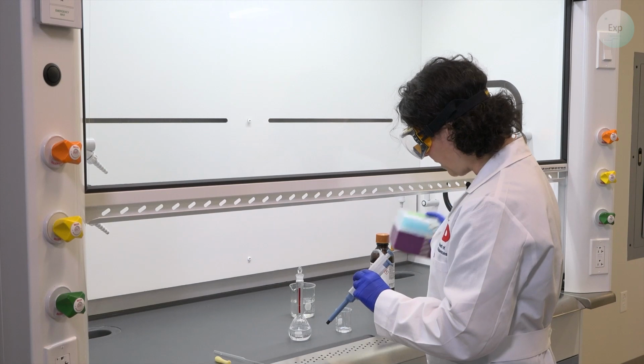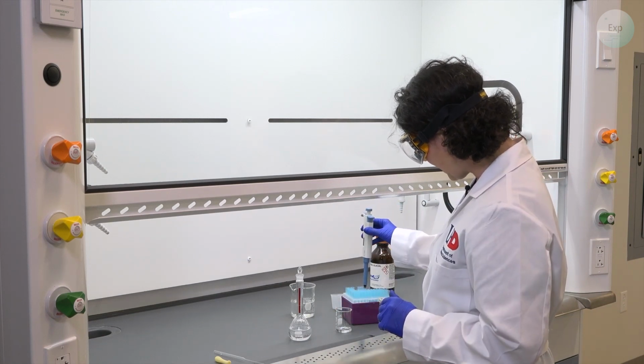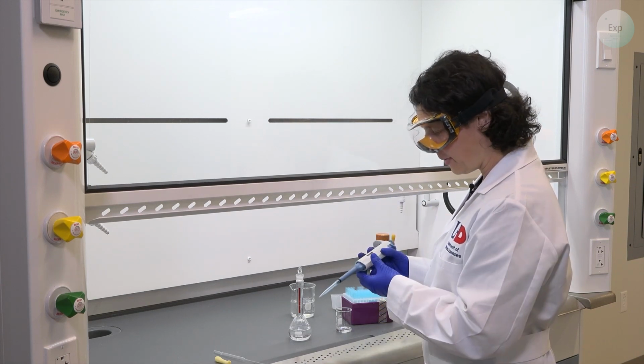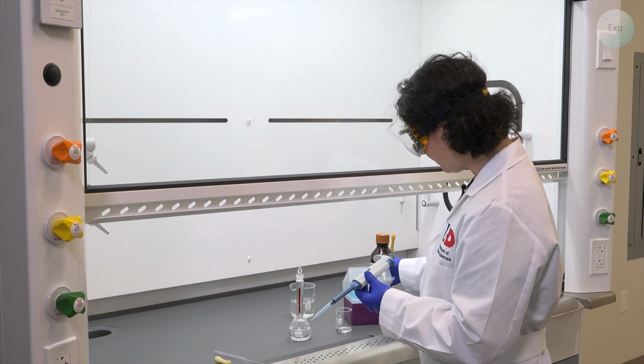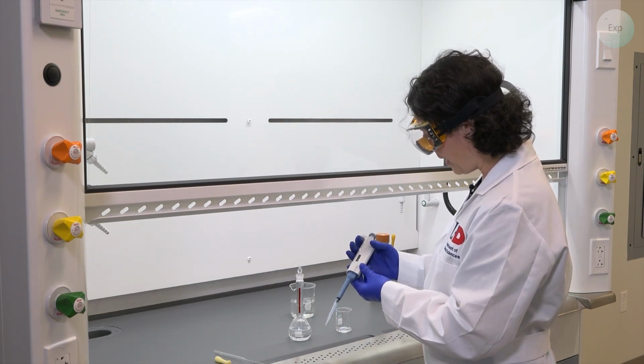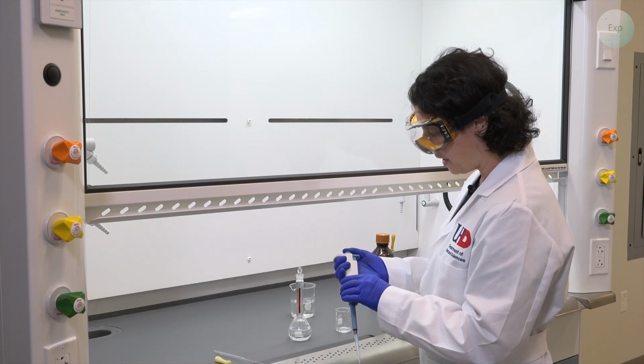Then we bring in our tip. We open it up. And without touching the tips at any point, we're going to slide the micropipette into it and create a tight connection. Then, to use the micropipette, there are 2 clicks in the plunger.